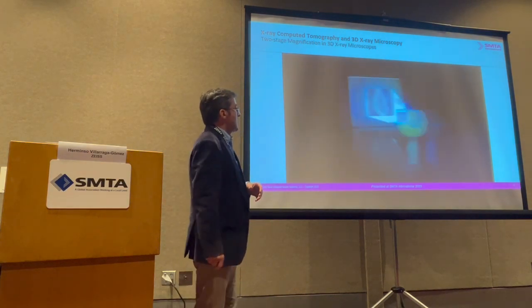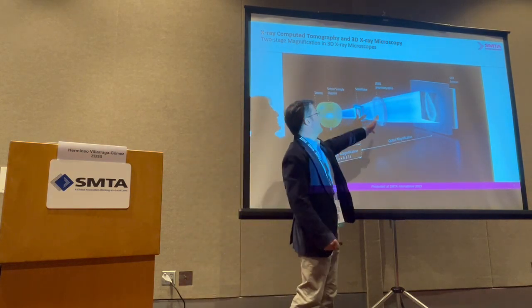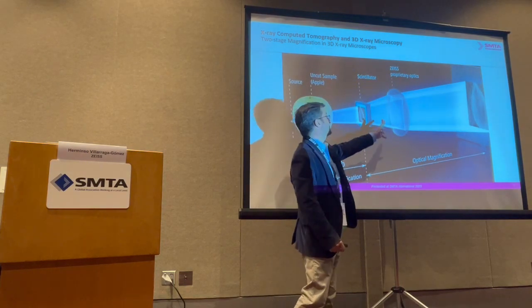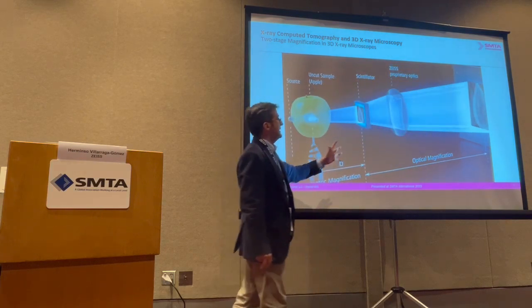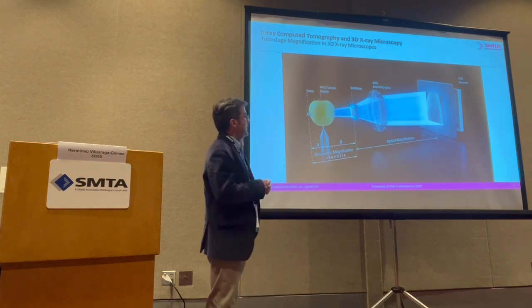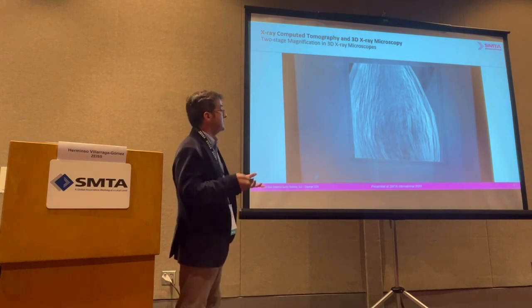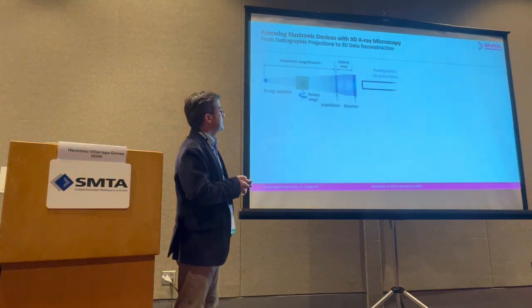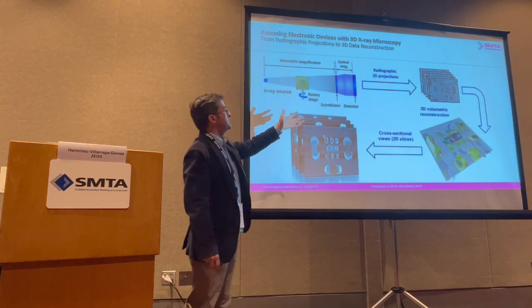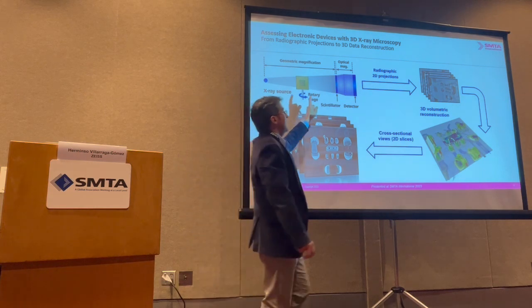If we use the X-ray microscopes, then what we have is additional lensing here. So the X-rays just hit the scintillator here, then convert into light, then it gets magnified by the lens, and you can change those lenses and get a magnified image over the CCD detector. And that's how we are getting the power of resolution at a distance in these types of systems. The typical inspection workflow looks like this. You basically collect, after you get the setup in your instrument, a set of projections.